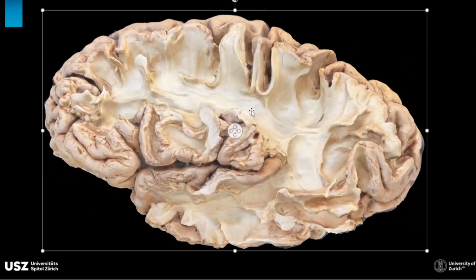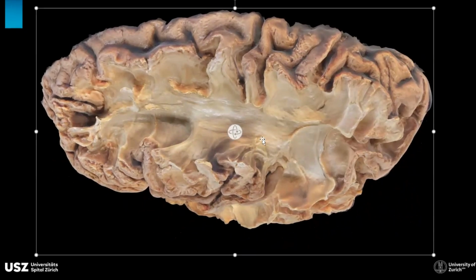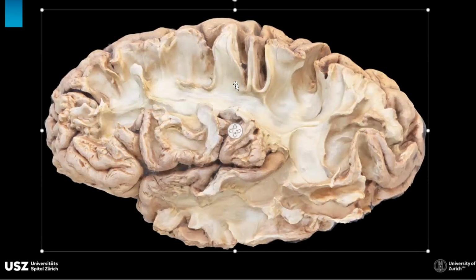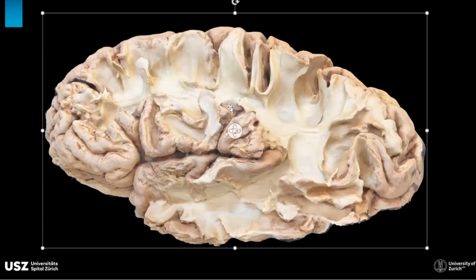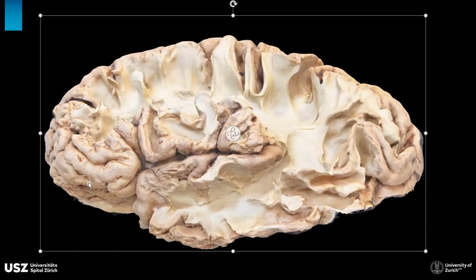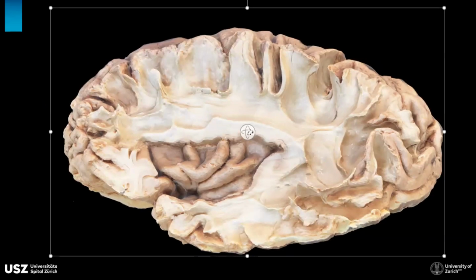You will see an orientation of a fiber system, and the superior longitudinal fascicle is exactly that: longitudinally oriented fibers going deep to the middle frontal gyrus, inferior parietal lobule, and middle temporal gyrus, connecting these areas. You will not find a single termination. Everybody of us will have a different fiber system. We will keep the opercula, which we will remove at the end to finally expose the insula.